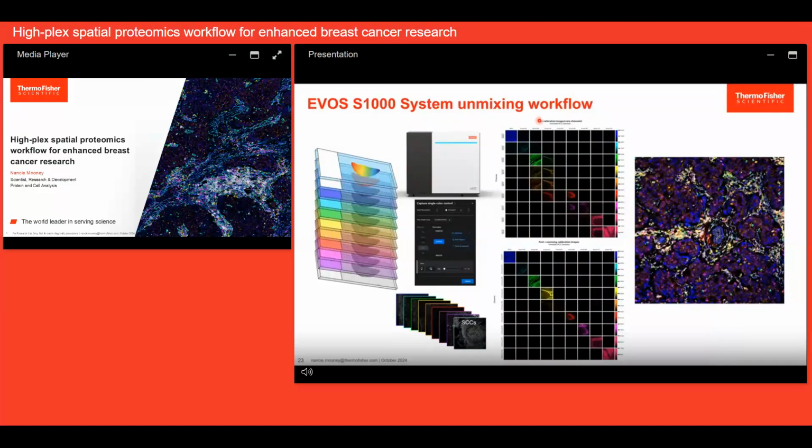So with the raw calibration images, you can see that there was a lot of bleed through from 514 into other channels. However, post unmixing, that bleed through is eliminated. You can also see that over here in 647, 700, 750. This is also cleaned up in the post unmixing calibration. So this unmixing allows us to take fluors that have fluorescent spectral overlap and clean them up enough to use them as individual targets in our experiments, thus allowing us to create images that look like this.